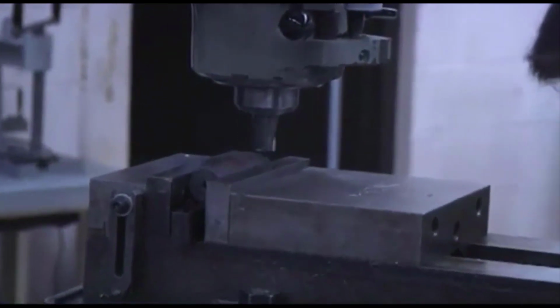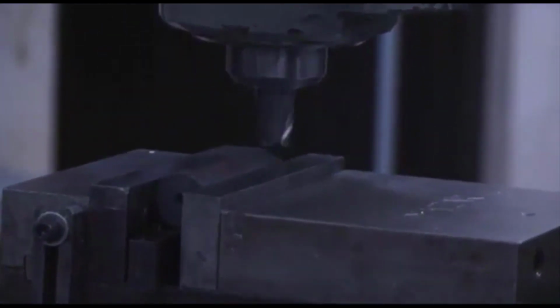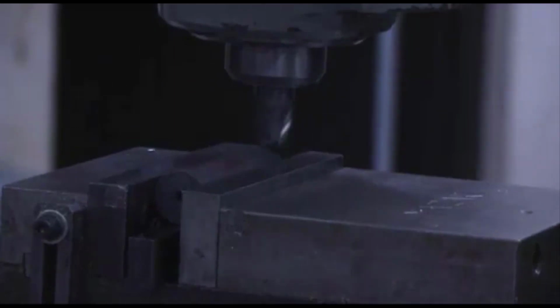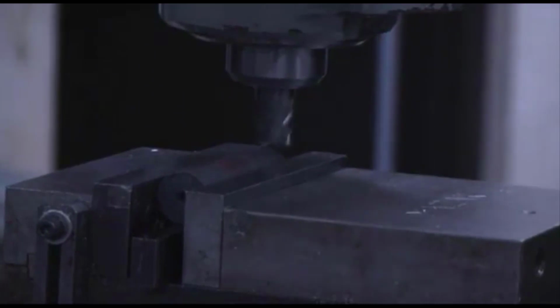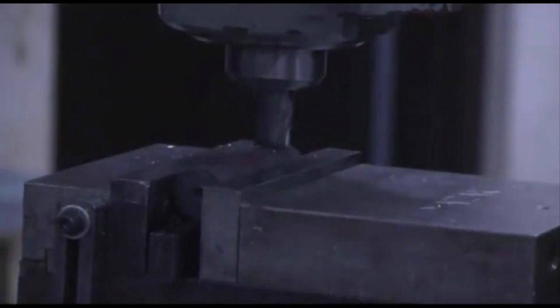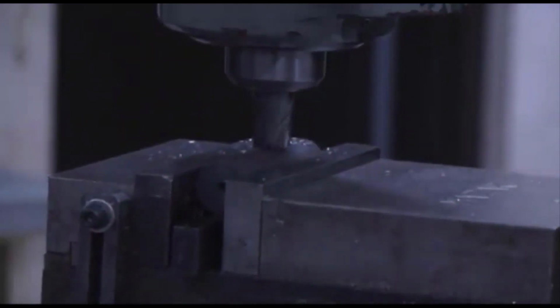And now that I've got that 0 point, then I will raise it up between 15 and 18 thousandths of an inch so that we can remove just enough material to get a nice wide enough flat surface. The goal here, of course, is to just move the specimen under the end mill smoothly and slowly so that we get a nice surface finish.